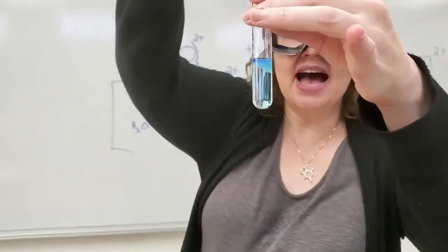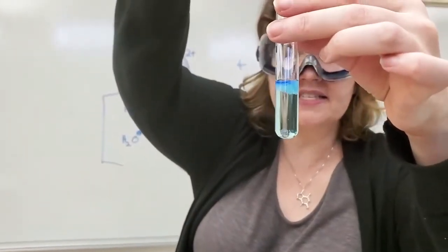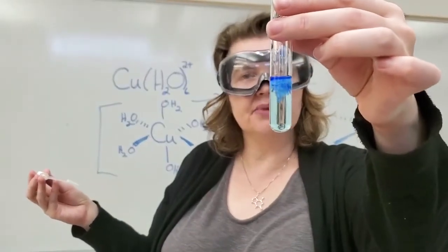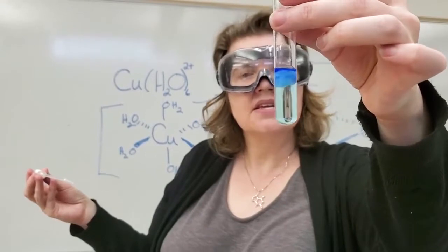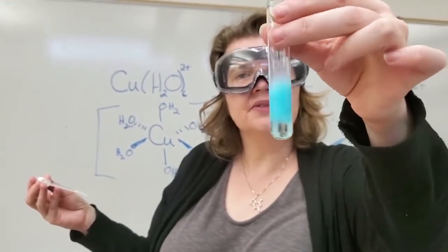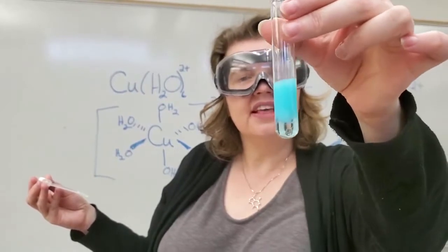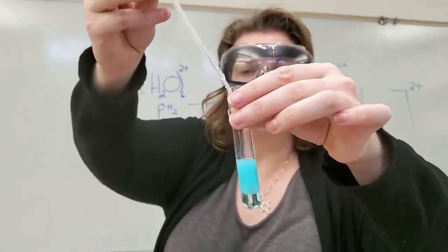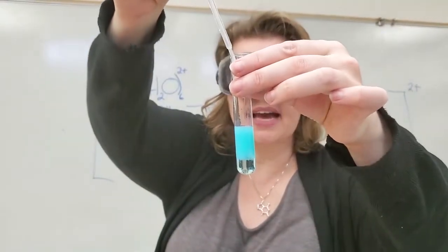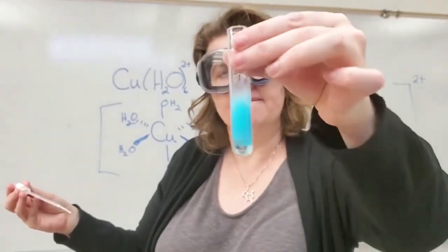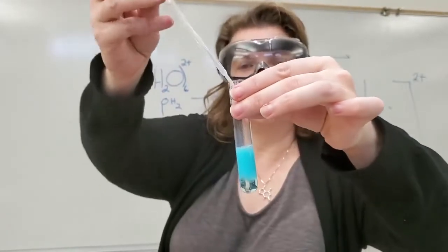As I add this ammonia to the solution, you can see two different colors of blue forming here. Copper hydroxide is an insoluble compound. This color here is the hydroxide. It's binding that copper ion, so we're making copper hydroxide. That is insoluble. So that's the first thing that happens, is as I add it drop by drop, I am binding all the copper into the form of copper hydroxide.